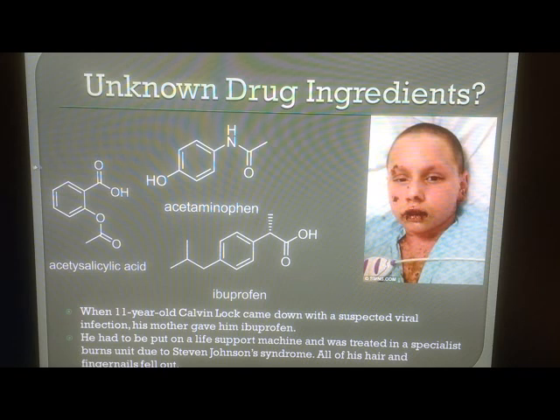Sorry, I'm not showing the structure of caffeine here, but that's going to be part of your pre-lab prep: to look up the structure for caffeine. Knowing the structure is important because that will tell you how polar each of these compounds is with respect to each other, and that relative polarity will tell you how far up they will move on the TLC plate, as you'll see later.